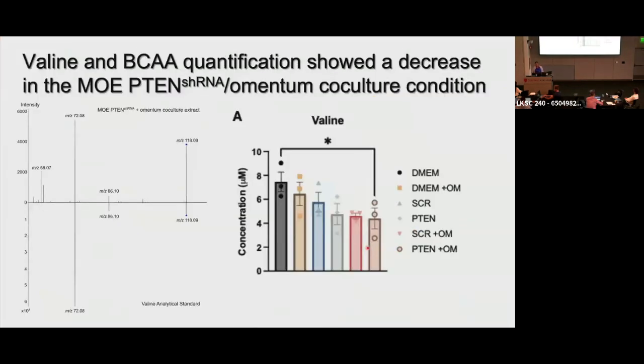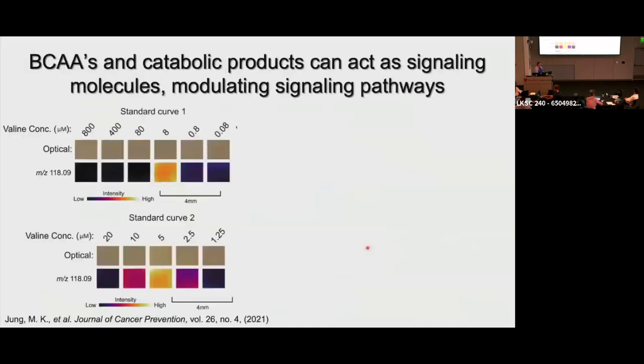So we had to put our analytical chemistry thinking hats on and think about what was happening here. So when we went back and thought about this, the concentration of valine in the media is actually quite high. Instead, it looked like it had increased, but when we went through and just did a simple test of valine in the media, so we just did successive little dilutions here, we actually found that with high concentrations of valine, you're getting ion suppression within the system.